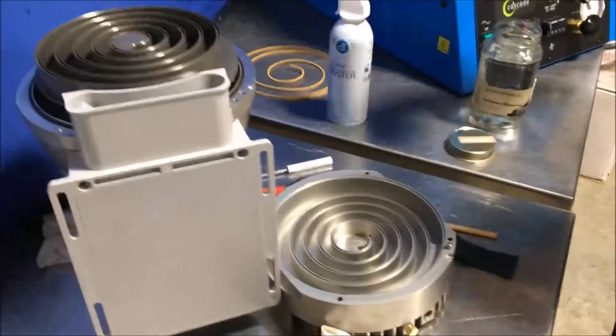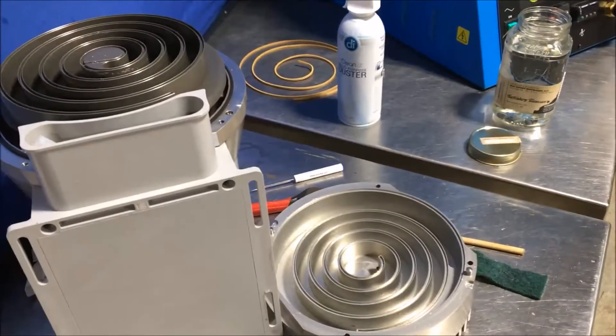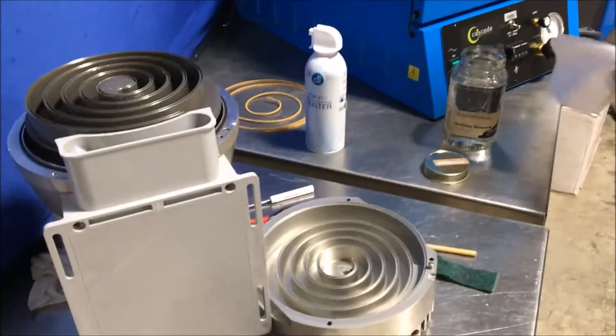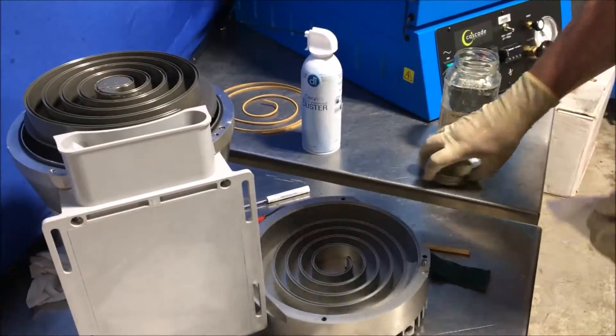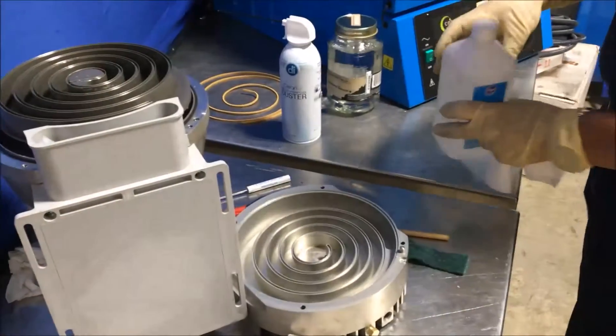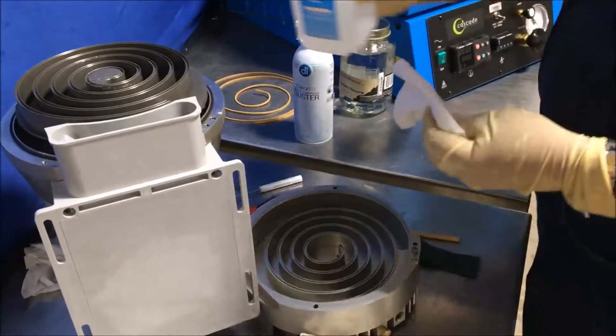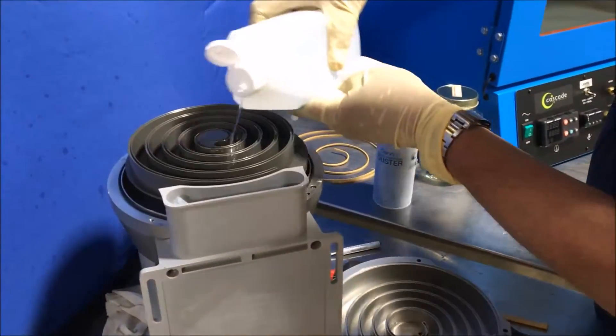For a final clean, using a clean lint-free cloth, we move away from the Everclear and use isopropyl alcohol to do a final clean to remove any residue that was left by the Everclear.